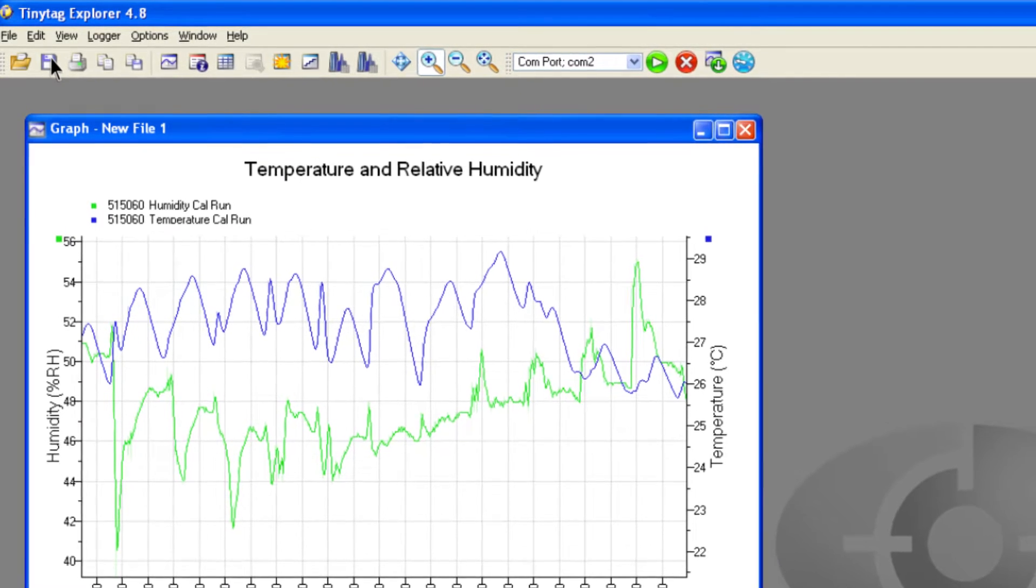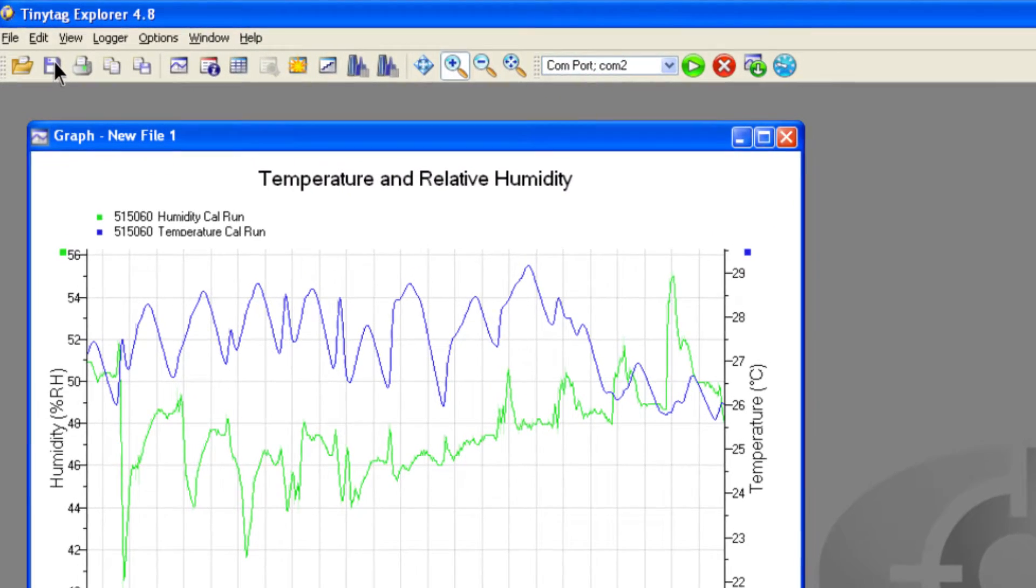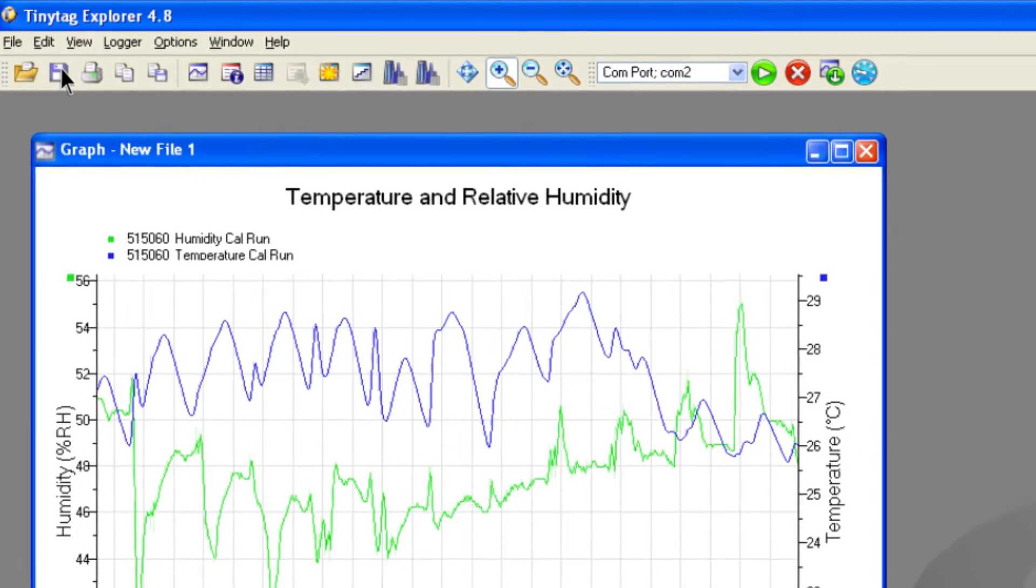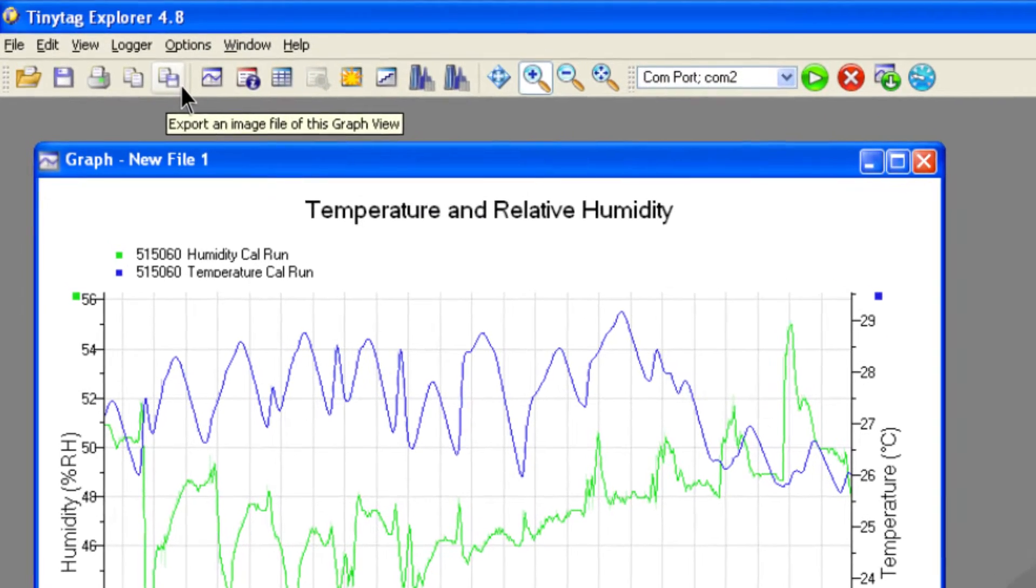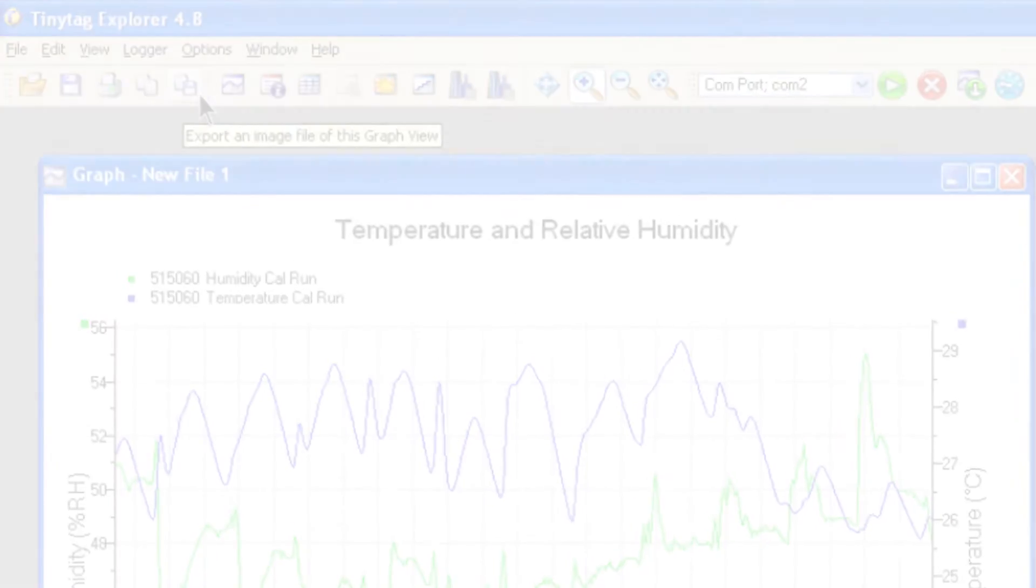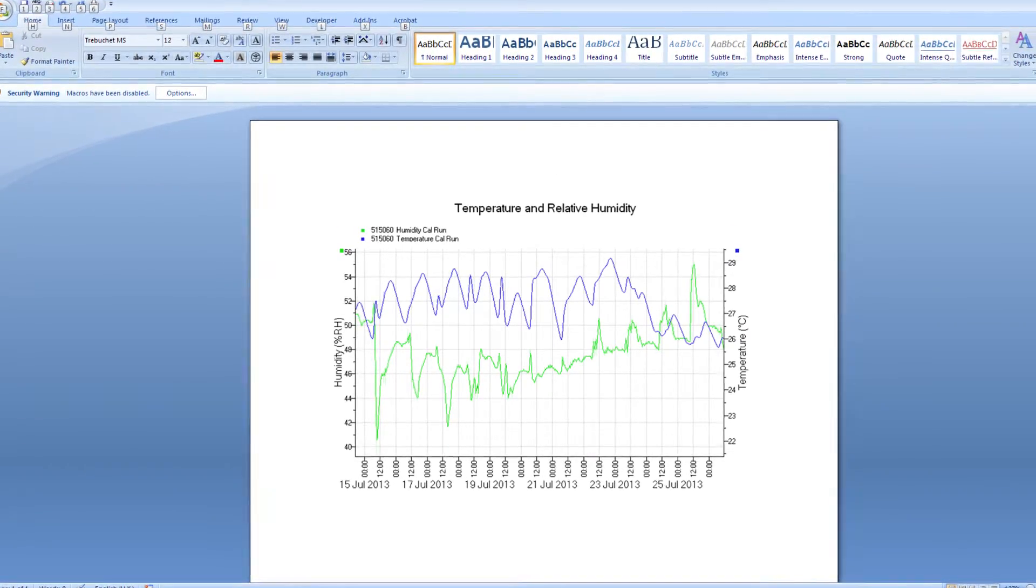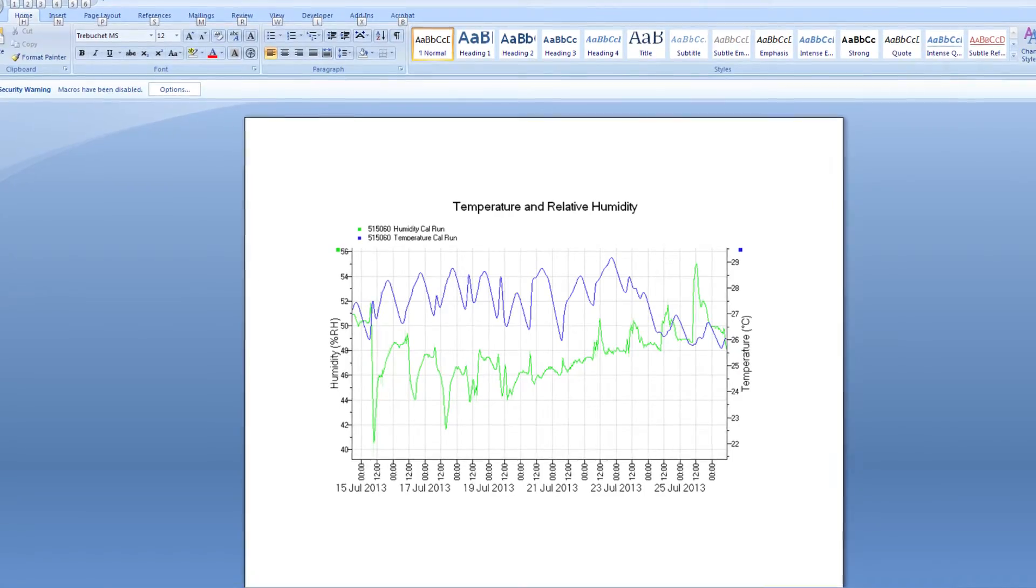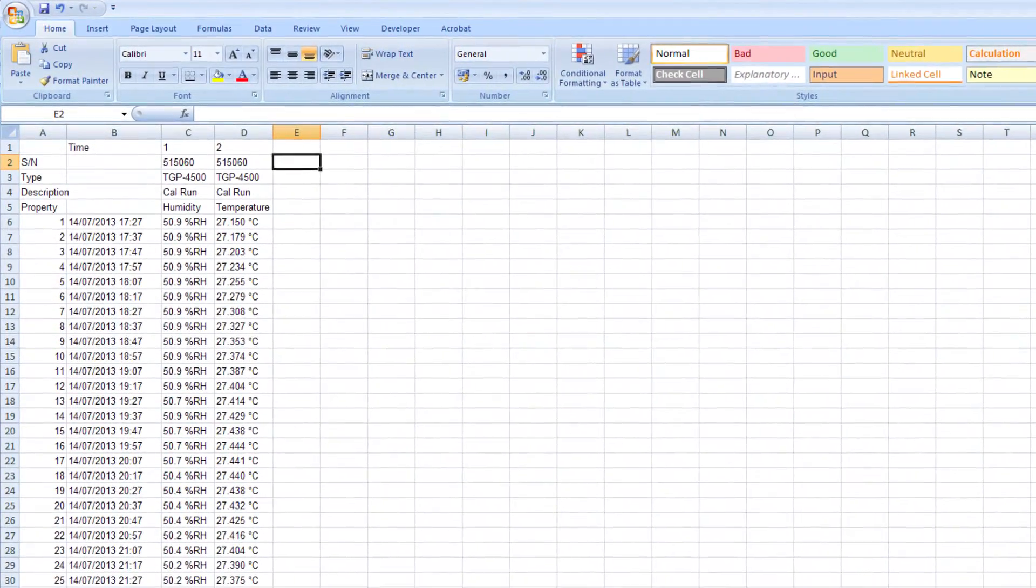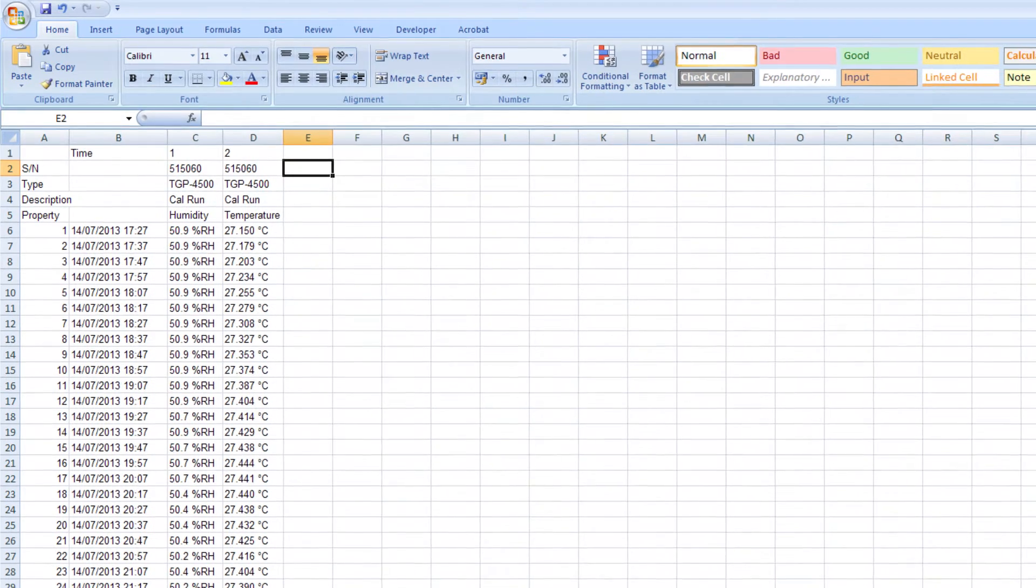The data downloaded from each logger can be saved to your computer by clicking on the save icon. Data can also be exported as a file in various formats or by using copy and paste for use in other programs. Graphs can be exported as images for use in reports and the table of readings and summary views can be exported as tables for use in a spreadsheet or a third party database.